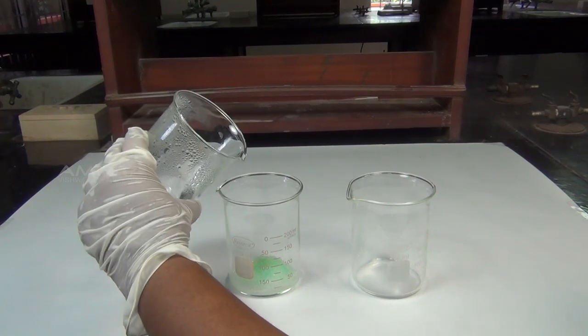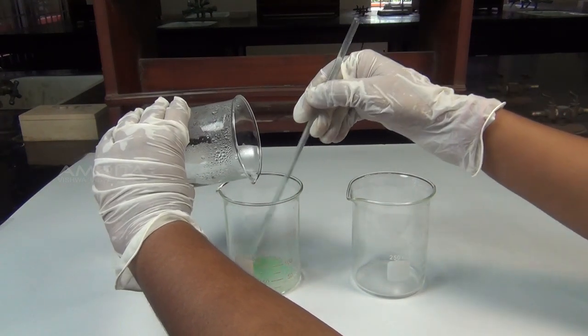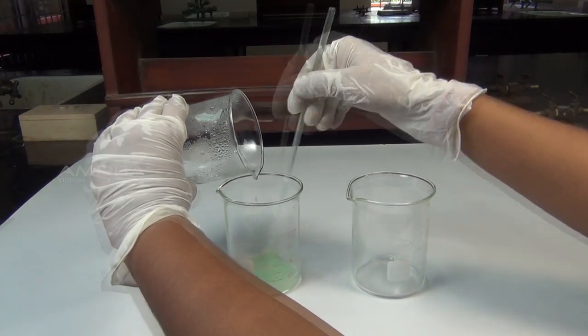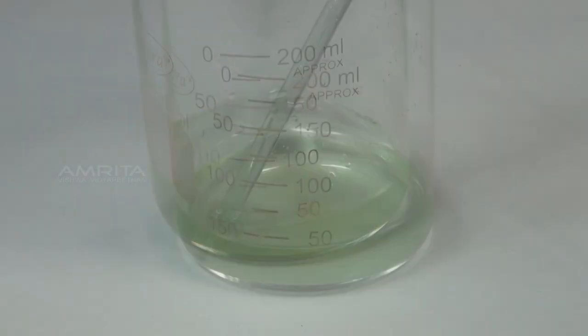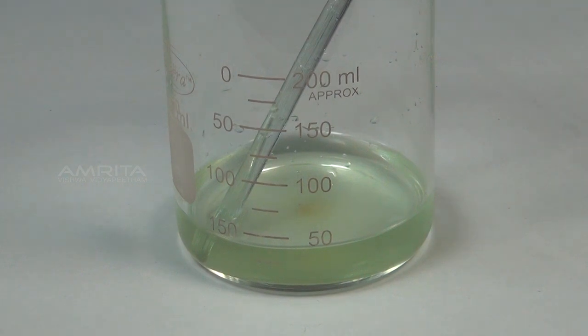Add the boiling hot water to the contents in the first beaker in small installments at a time. Stir the contents of the beaker with a glass rod until the salts have completely dissolved.